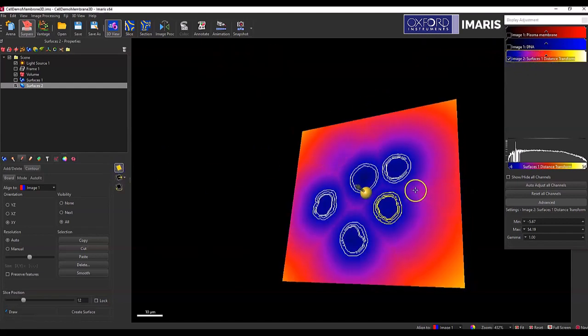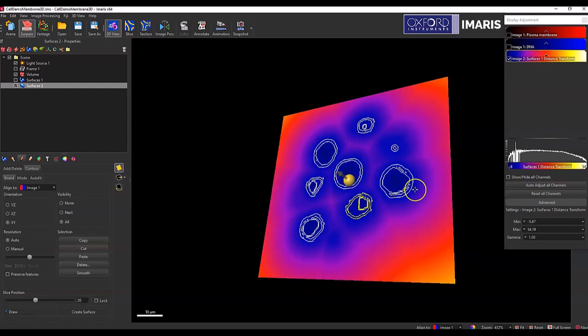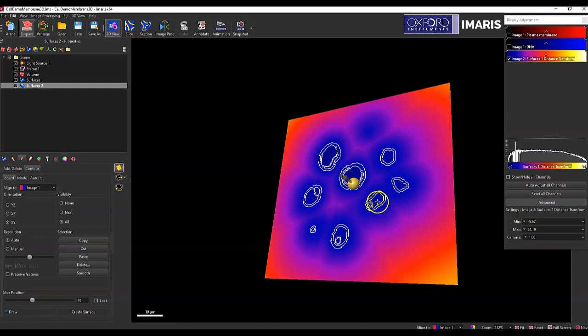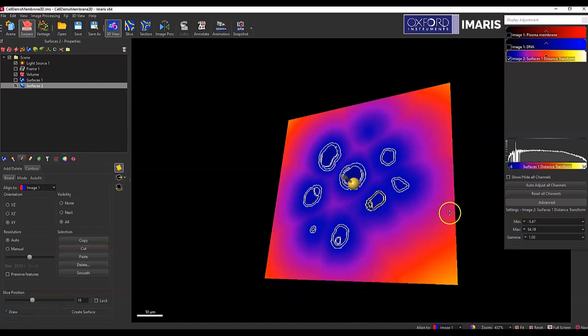And with the distance transformation channel, you can see that I don't have signal intensity within the objects that I would want to be able to place the seed points in. All of my signal intensity is out here in the periphery. So that's where the seed points would be placed.